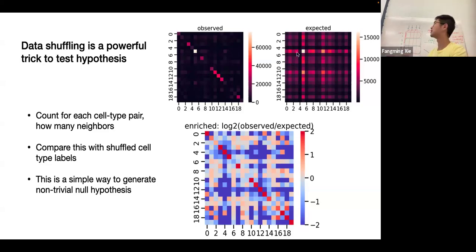So essentially, if you calculate the observed cluster pairs in space versus the expected, meaning randomized pairs in space, and divide the two, you will get the enrichment ratio. It tells whether certain pairs are closer together or depleted with each other. So that's this enrichment ratio thing you can play with.